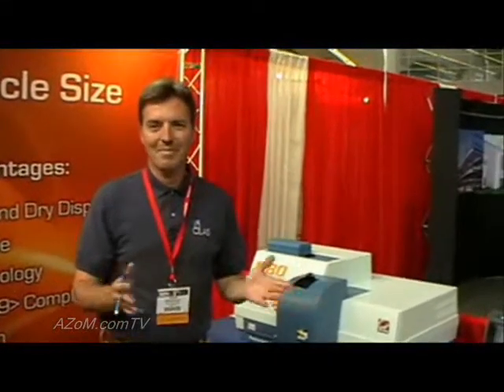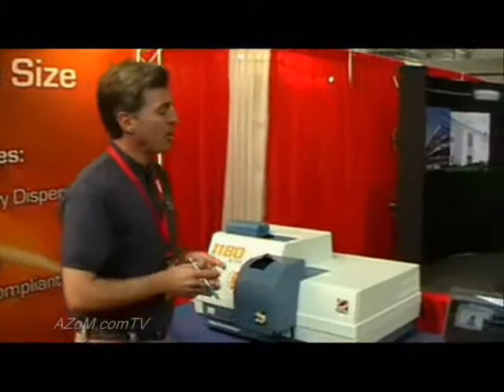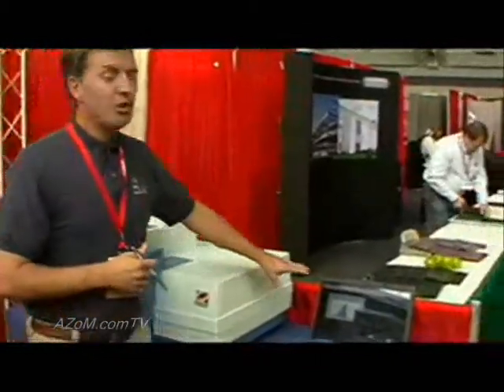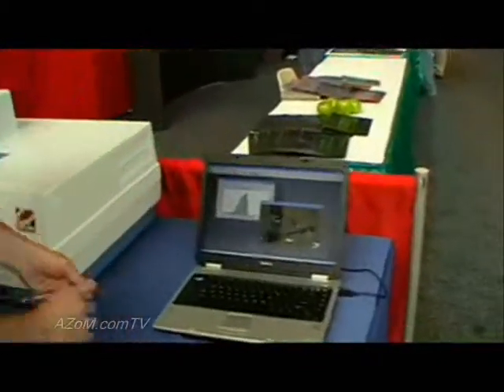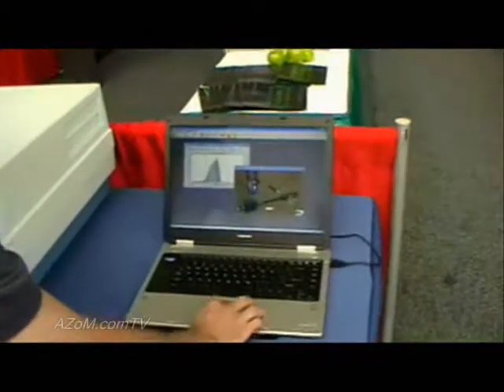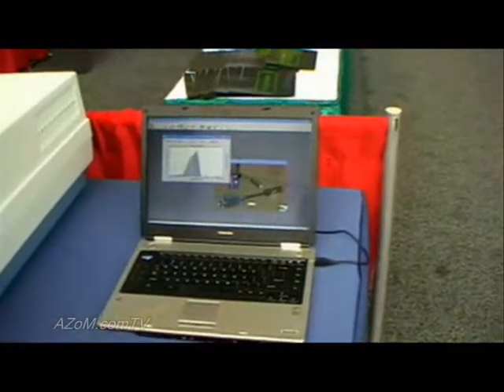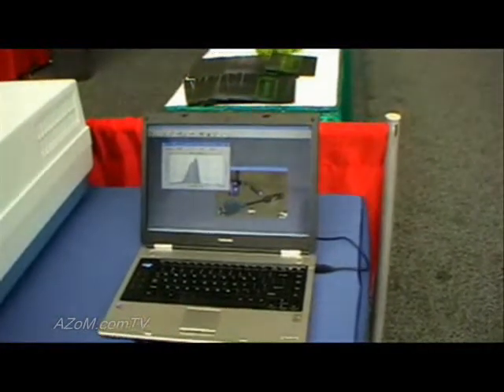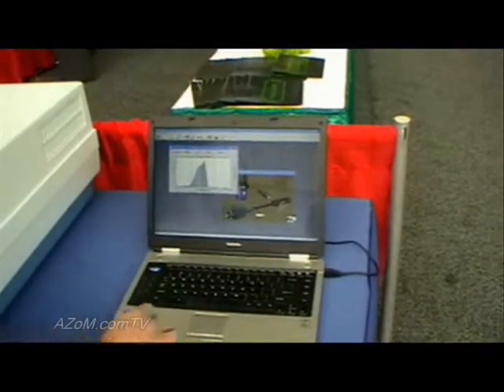Using the Size Expert software, we're able to analyze the D50, the D10, and the D90 to give you a full particle size distribution.